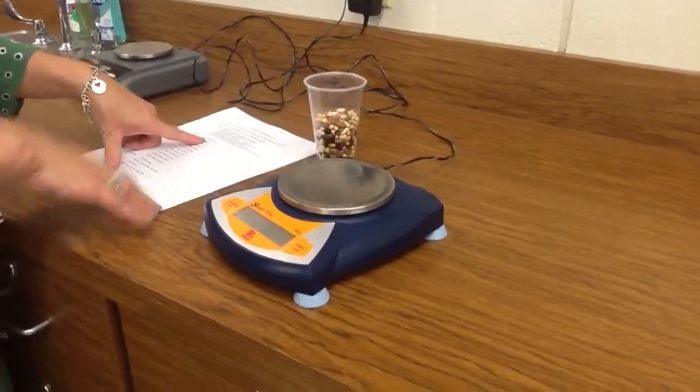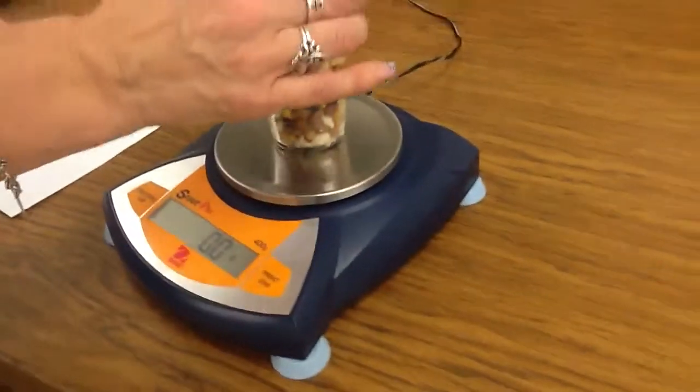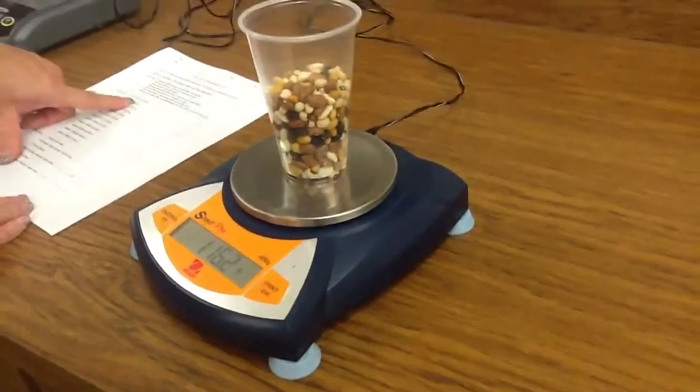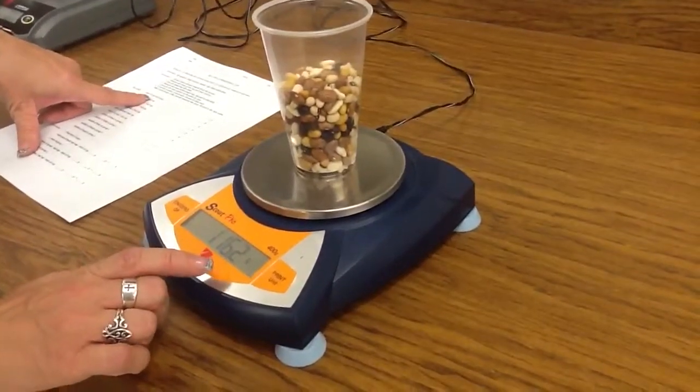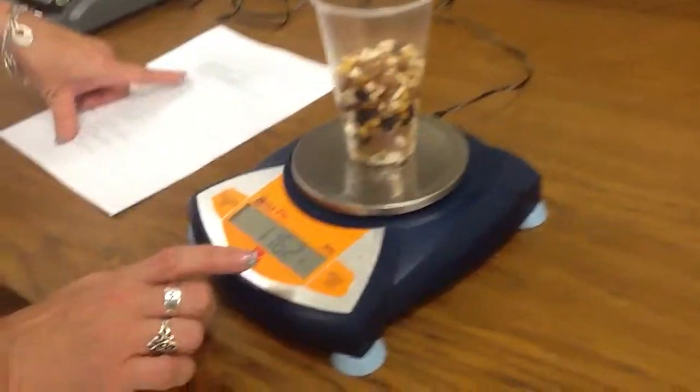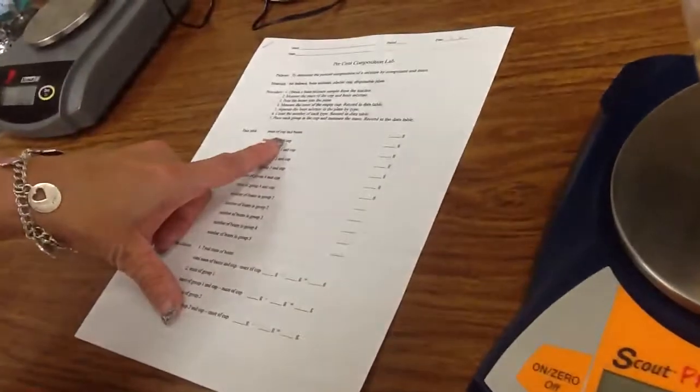The first thing that you're going to do is take a mass of the cup and the beans. You're just going to record this weight. My weight says 116.2. You're going to put that right beside the grams. It says mass of beans and cup.